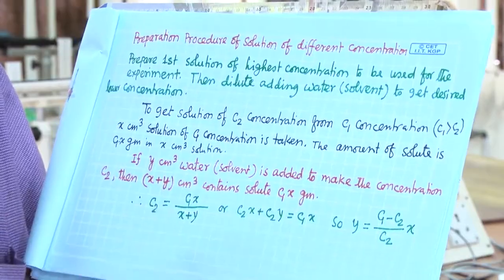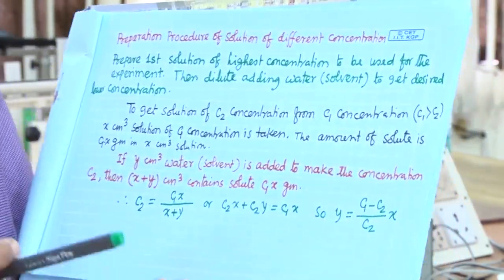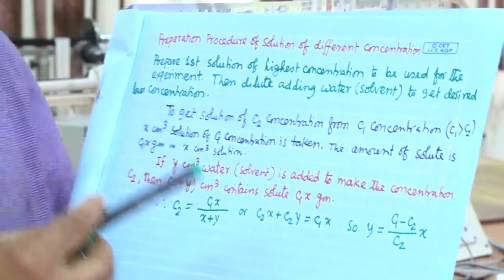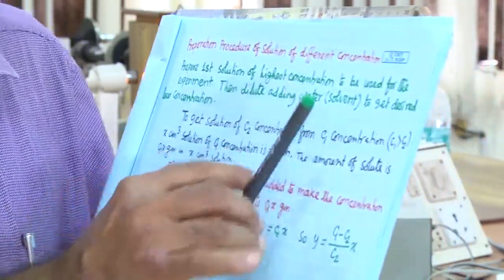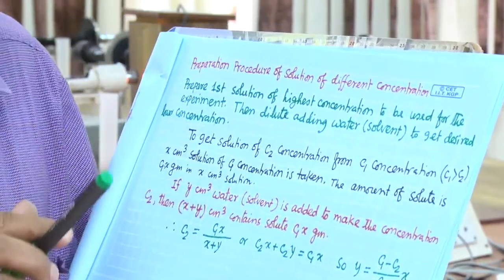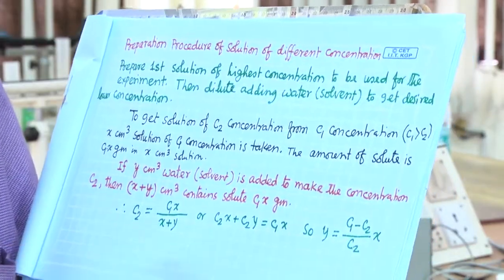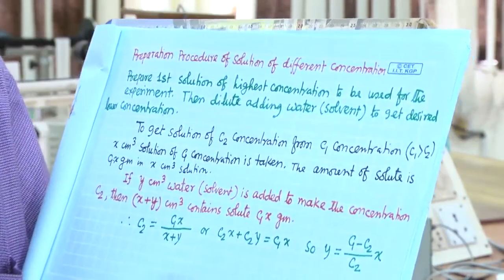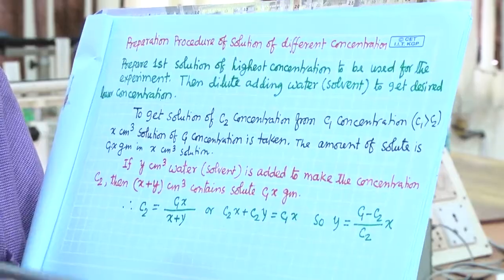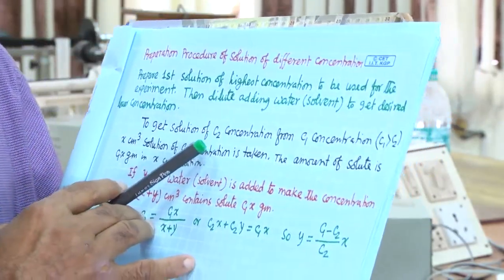That way we can go to lower and lower concentrations, and for each solution we will do the experiment. Finally you can pour water arbitrarily, or pour some more sugar, to make the unknown solution, and do the measurement again.